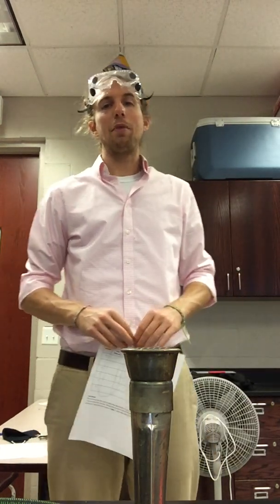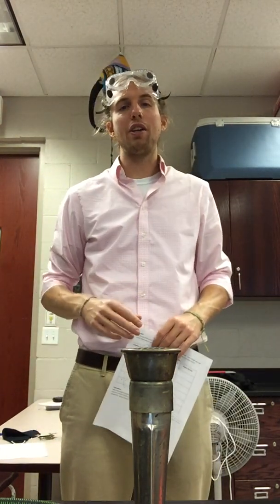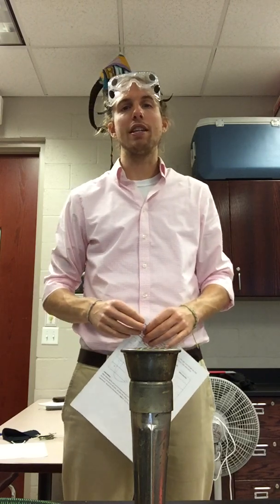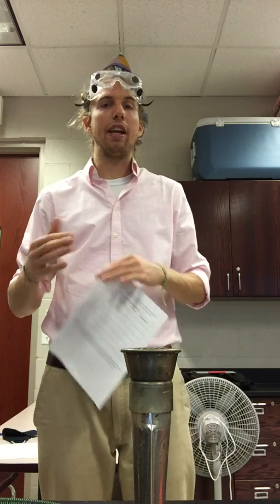Hi everyone, today we're going to try the flame test lab. Flame tests are a really cool application of chemistry because they allow us to figure out what sort of elements might be present in a sample by burning them and seeing the characteristic colors.